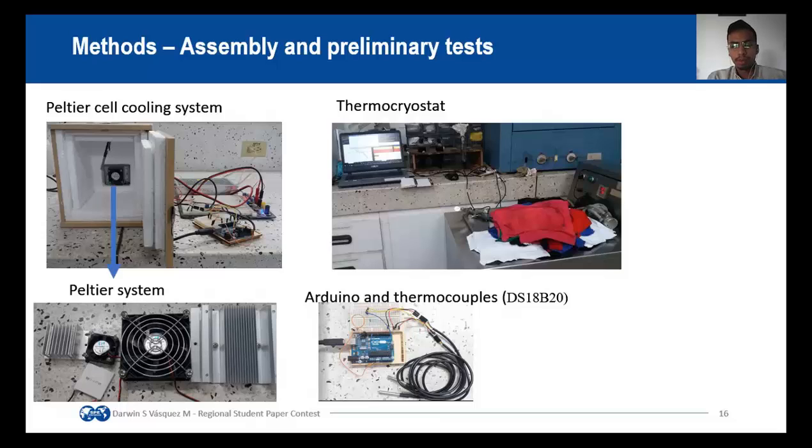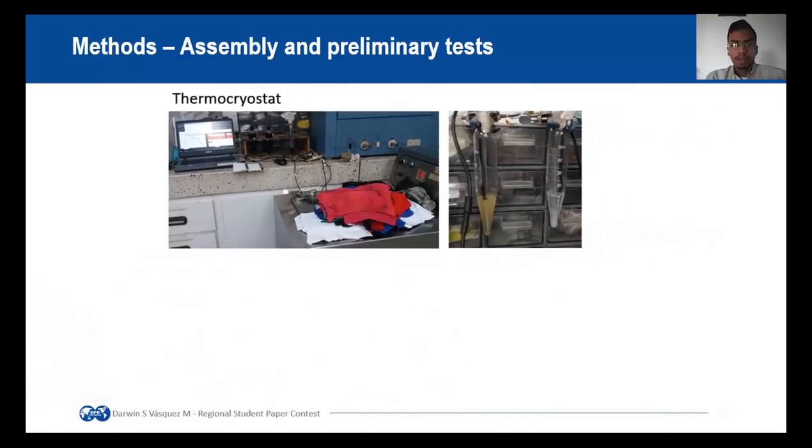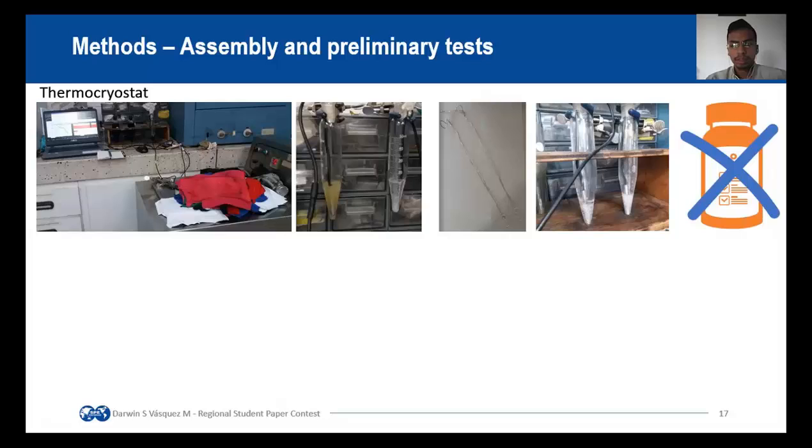I used centrifuge tubes to introduce the 10 milliliter samples into the vat. The system for measuring the temperature was the same in all assemblies, as you see here. Later, I made improvements to the assembly, adding a stirrer to blend, decreasing the sample volume to 3 milliliters, and discarding oleic acid due to its low purity.